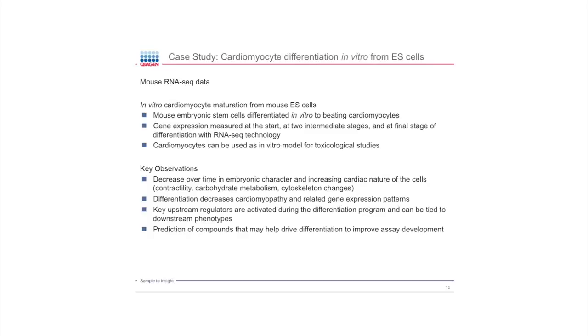And one way to use this upstream regulator analysis, and other tools like that, is to understand what other compounds might help drive the differentiation. So could you improve the assay or this differentiation program by adding compounds? And you can see an example of that.